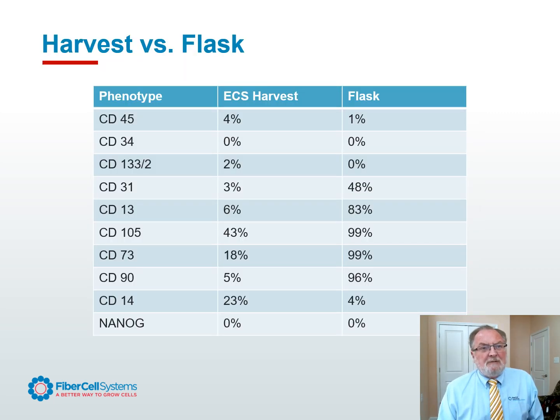Flow cytometry revealed that these small diameter suspension cells harvested from the extracapillary space of our Placental Co-Culture were phenotypically indistinct, without any predominant characteristics. After these cells were cultured for 5 days in a T-flask with FBS, they reveal themselves to be 99% mesenchymal stem cell positive. These cells are either MSC precursors or true MSCs and reveal their characteristics only when cultured in flask with serum. Cell culture conditions have a profound effect in terms of the phenotype and behavior of cells.